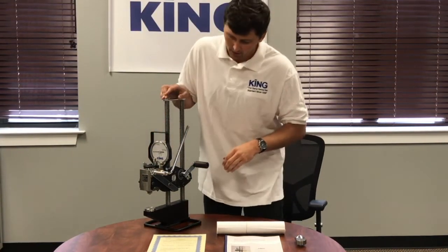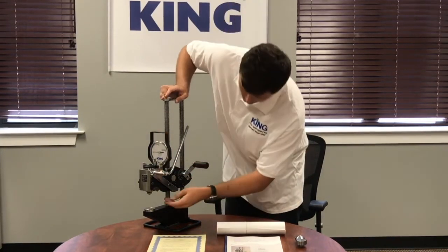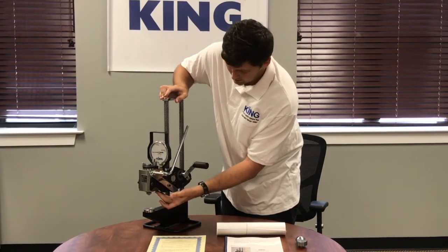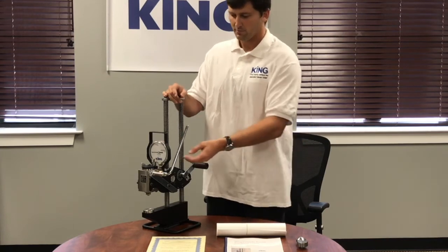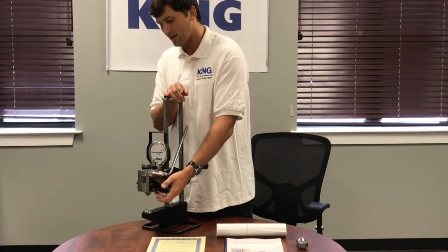One other component we added on the King Portable head is a drain valve on the bottom. You can't actually see it, but it's right behind where the 10 millimeter ball is. So when you go to change the oil, you'll be able to just run out the oil that way. It used to be on the back — this is a little bit easier so you don't have to tip the test head back.